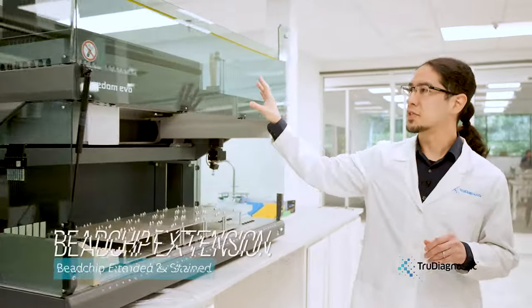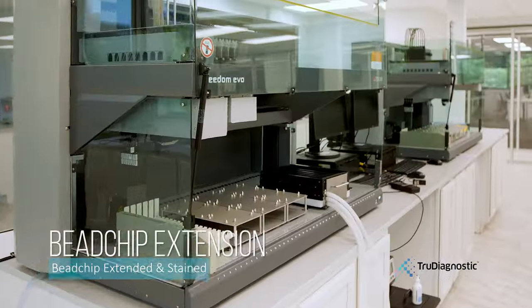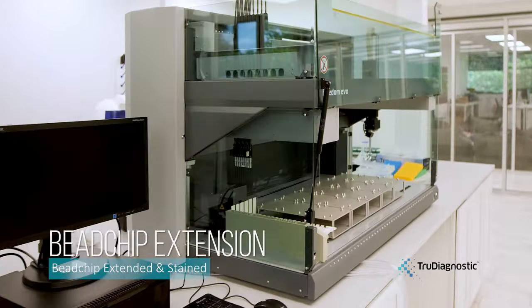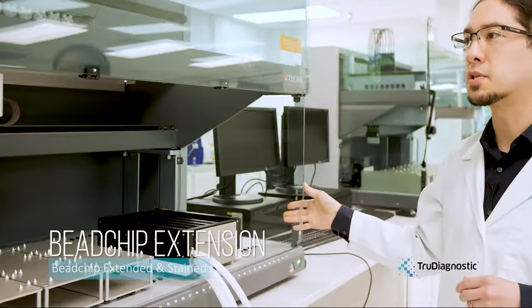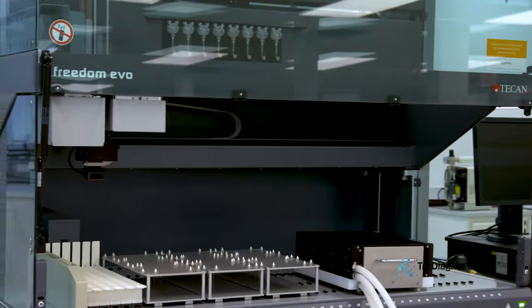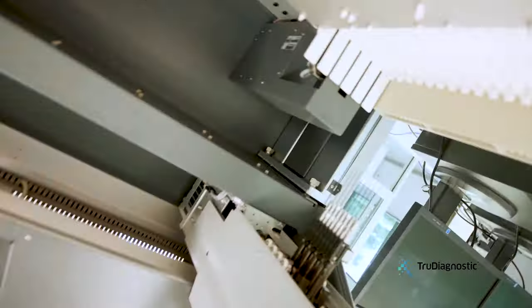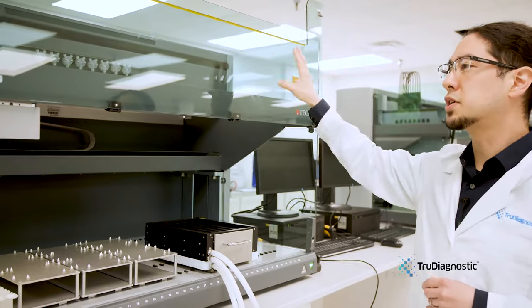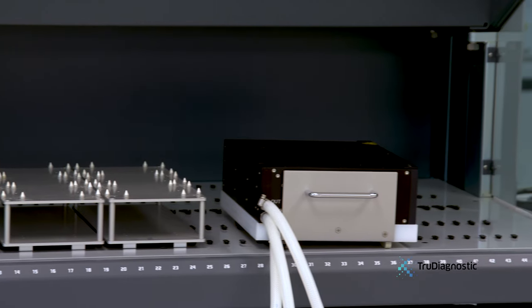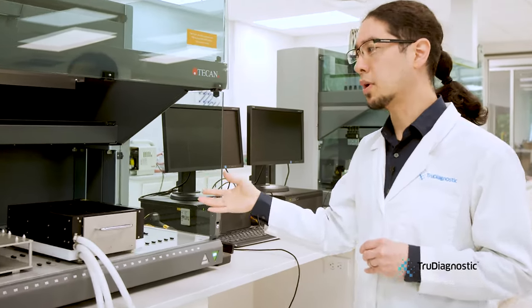What we have here are the Tecan Freedom Evos. These are automation machines that allow us to make the process of extending and staining the bead chips more efficient and smooth. These machines are very unique as they automate this part of the process, because this part of the process is one of the most important.